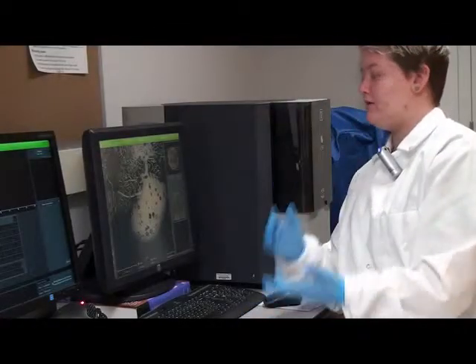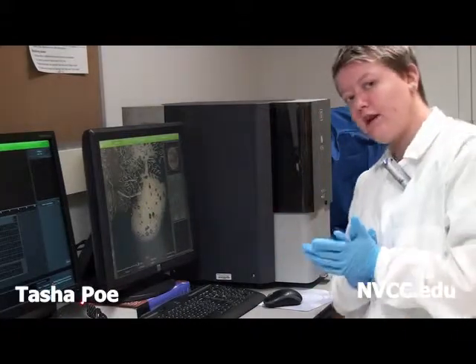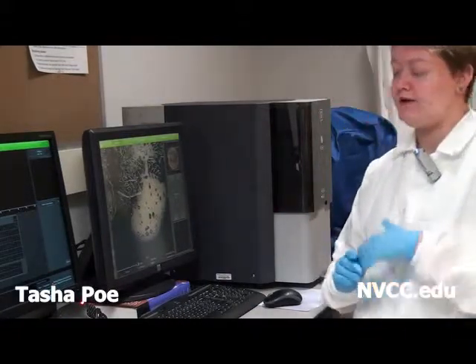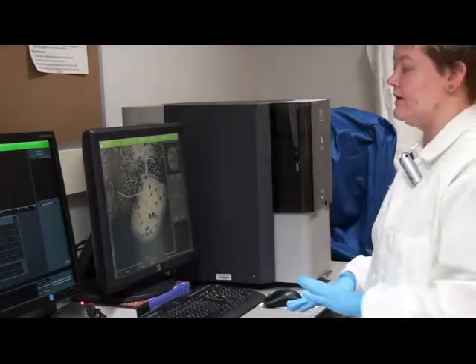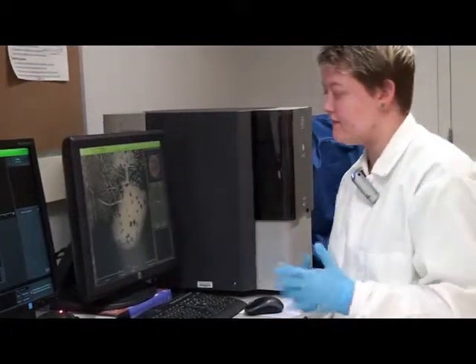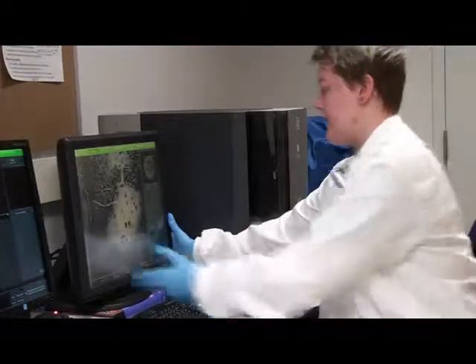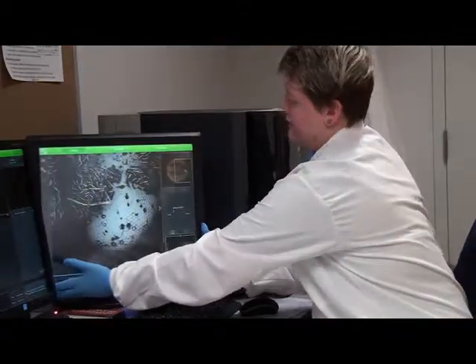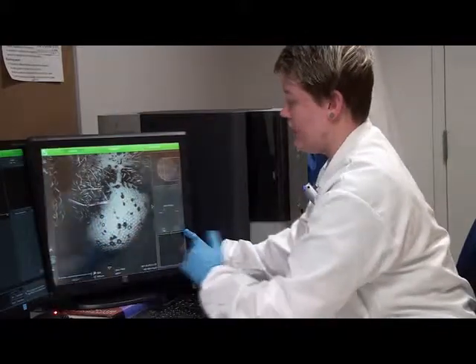We are looking at the sample of the gold-covered bug in the SEM right now. We didn't get to look at it under the light microscope, but we did get to look at the spider. This looks really cool — way cooler than the spider did under SEM. We were able to get a look at the spider's eyes under the light microscope, but it is not nearly as cool as this. You can see here a beautiful compound eye that you can see very well under SEM.